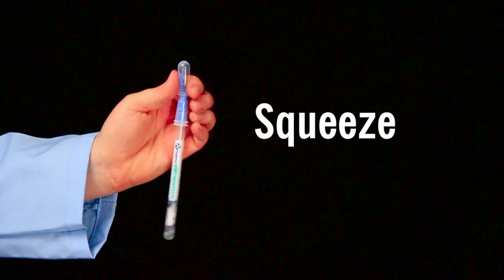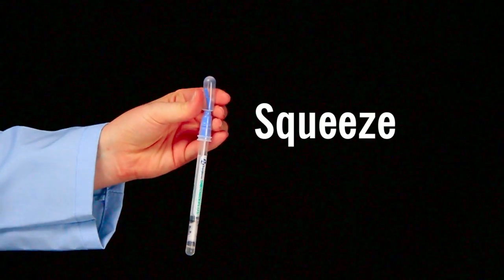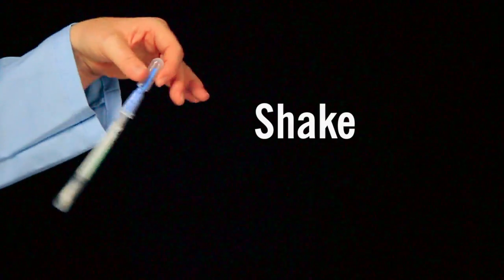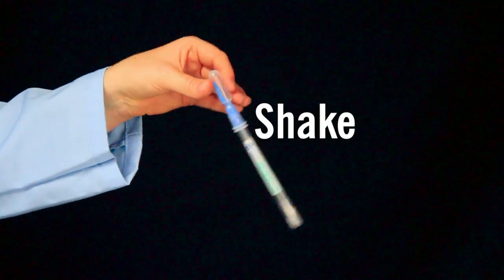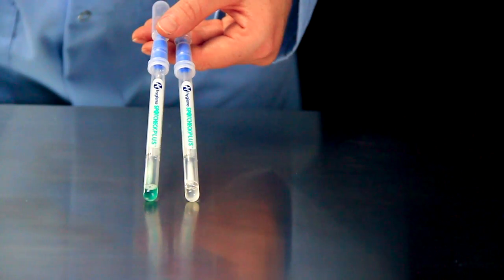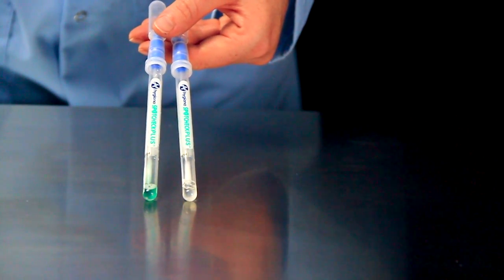Next, squeeze the bulb twice to expel liquid into the tube. Then shake for 5 seconds. Be sure to store SpotCheck Plus upright during the reaction time.